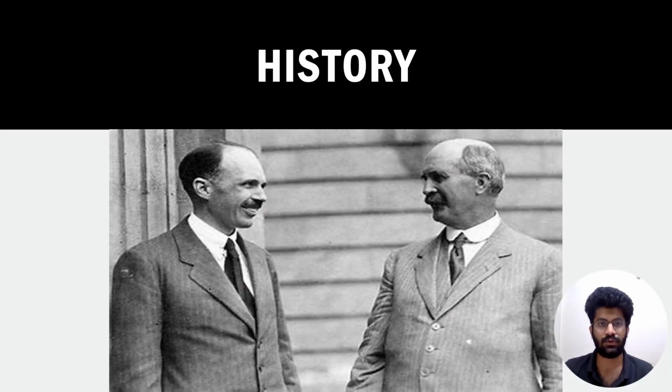Many physicists contributed in the making of the X-ray diffractometer, but the milestones were set by Max von Laue in 1912 when he confirmed the electromagnetic nature of X-rays by observing X-ray diffraction, and the Bragg father-son duo for developing Bragg's law and studying crystal properties for the first time using X-rays.